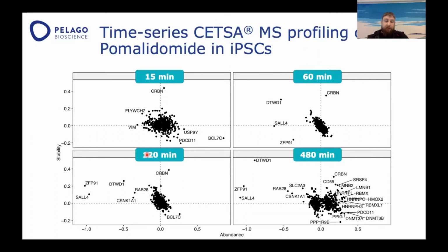And of course, we could look at this in a time-resolved manner, and then we can see that the binding to the target happens in no time. So at 15 minutes, we already see clear stabilization of the cereblon. But degradation of the novel substrates started to happen only after 1 hour.